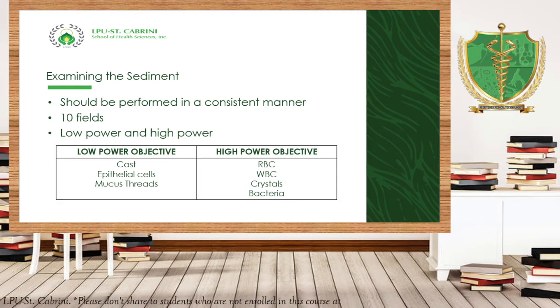Remember, low power field is 10 times magnification. Okay, that is the 10 times magnification. And remember, that is used as initial screening of our urine sediment. Okay, as per low power field or LPO or LPF, you are going to observe the following: cast, epithelial cells, and the mucous threads.